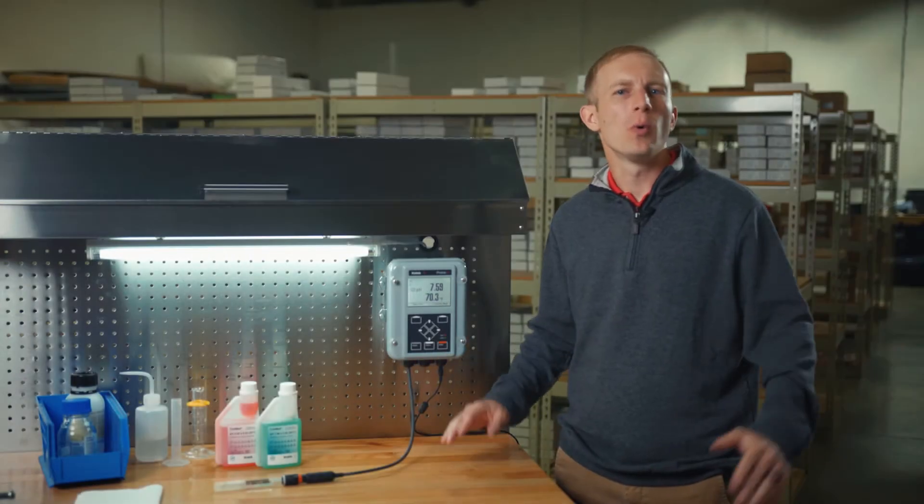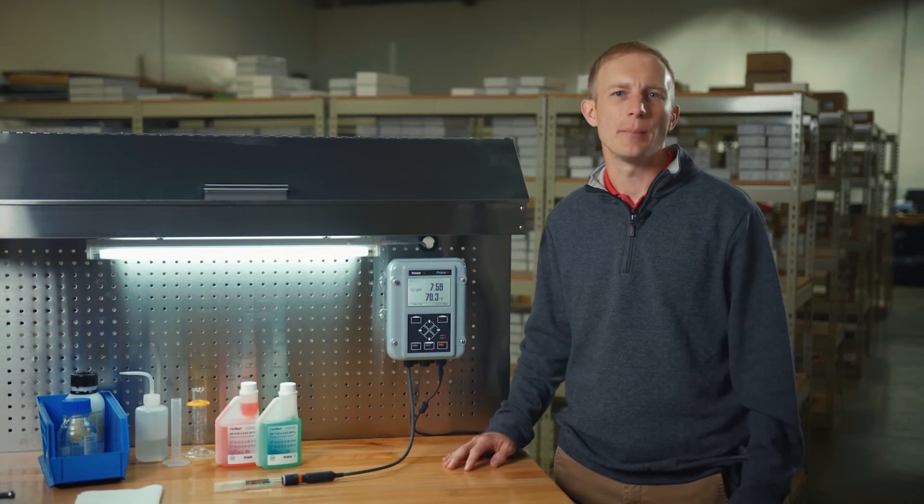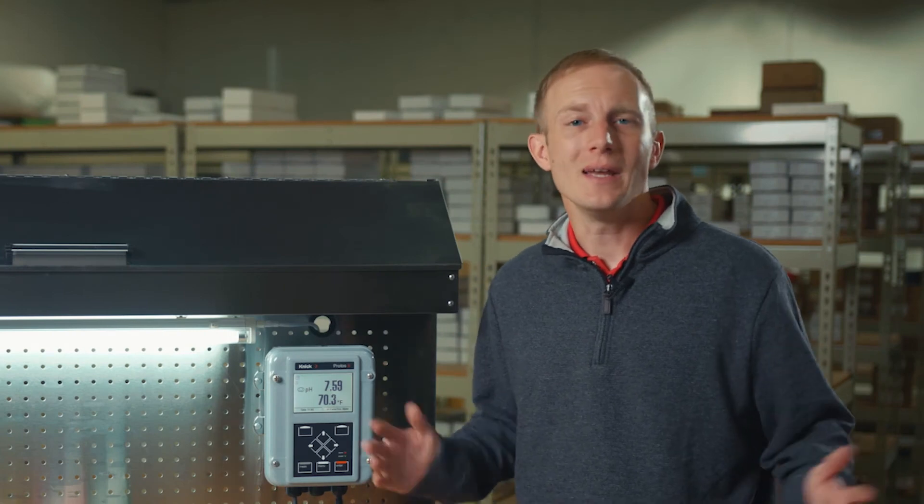Hello everyone, this video will walk you through the steps to perform an automatic 2-point pH calibration using the Protos 4400 transmitter from Knick with a Memosens pH sensor. This calibration will be performed offline in a controlled environment right here in our workshop.